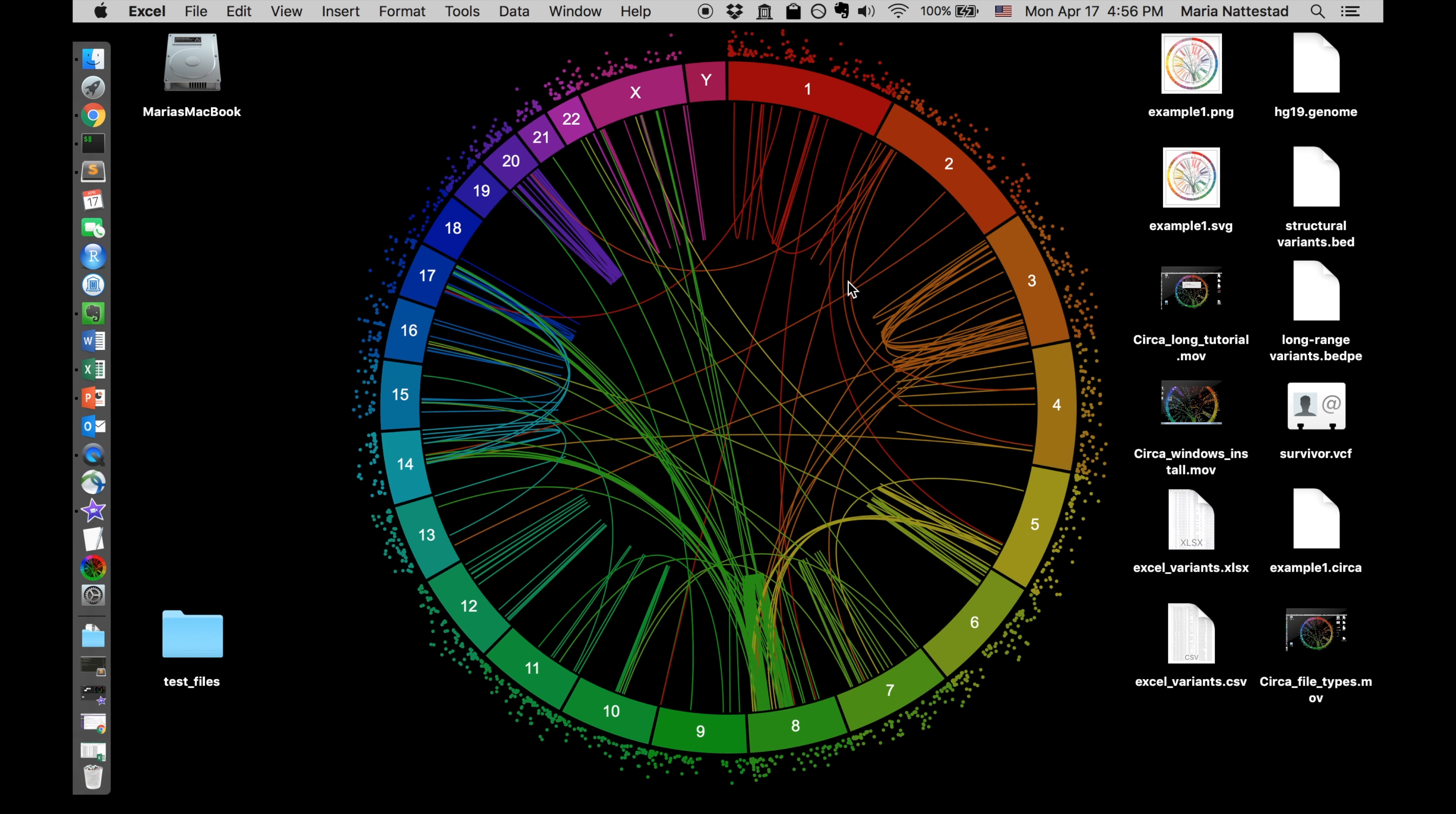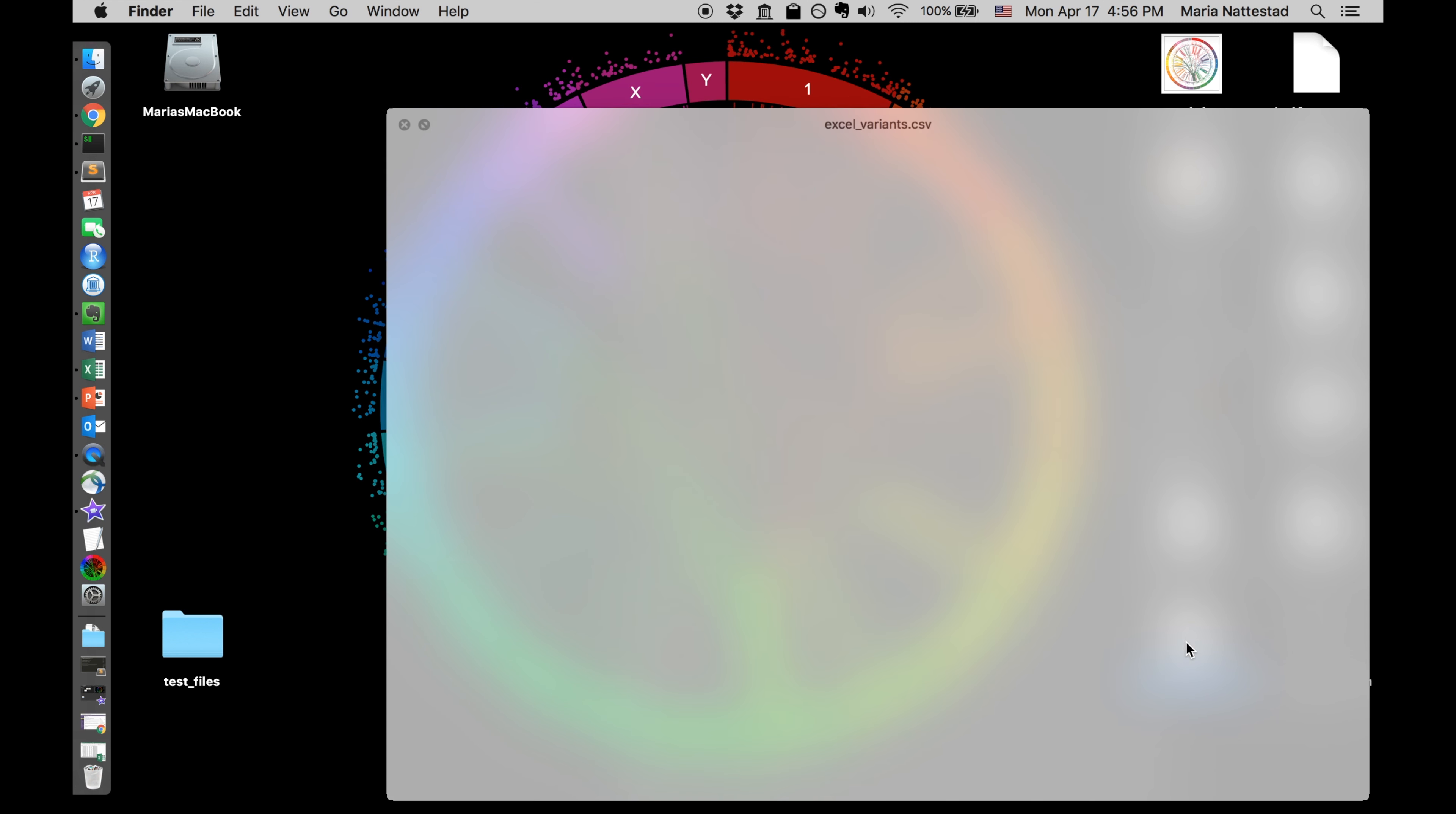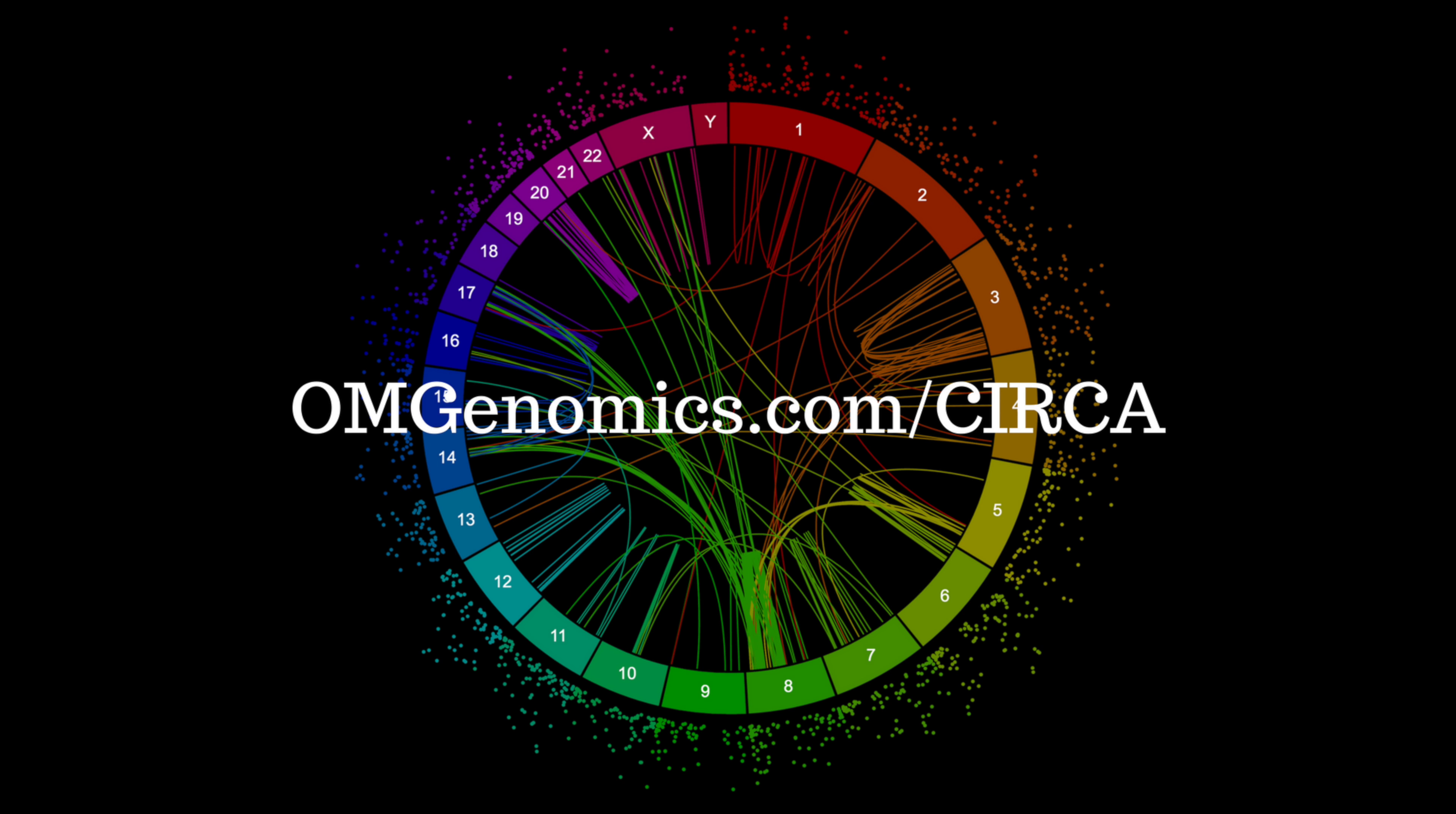And now if I minimize that, I can go out here and look. And so now I have an Excel file and I have a CSV file. And if I open the CSV, you can see it looks like a table. So that's all you have to know about file formats and CIRCA.